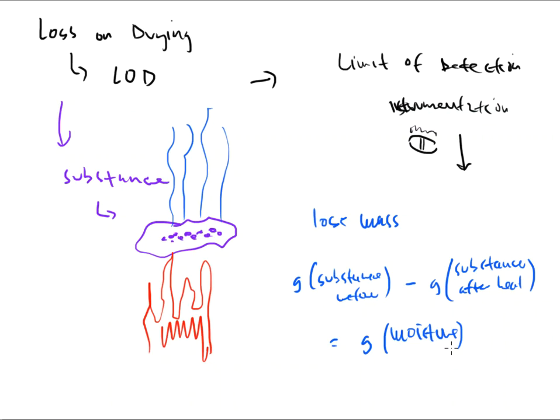Okay, so here's the drawback. I keep talking about moisture, and you keep thinking about water. And folks, that's okay. That's a large component of that number. It is water. But you need to understand that there's other things in a substance that can be driven off by heating it up. These are very volatile substances. They could be organic solvents that kind of come off at a really low temperature.